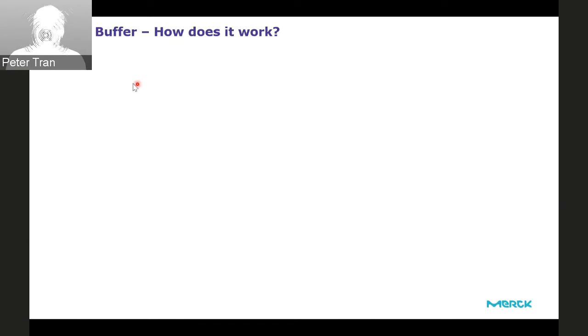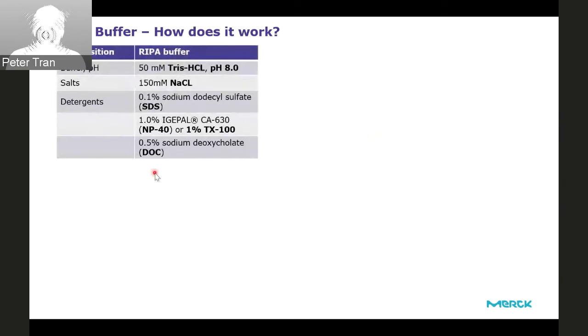Okay, so let's explain a little bit about the lysis buffer and how you can make it yourself or optimize it yourself, right? This is the common composition of the buffer. You need a pH, you need a buffer, you need salt, you need detergents, and sometimes you also need a reducing agent like DTT or TCEP. And I'll show you the composition of RIPA buffer, because it's the most common one that people use for lysis. In RIPA buffer, you have 50 millimolar Tris, pH 8.